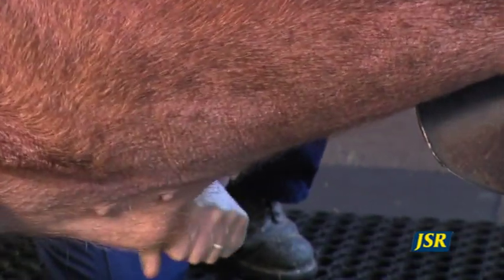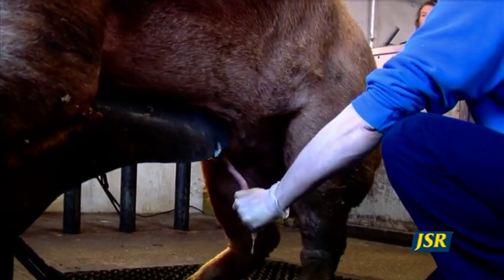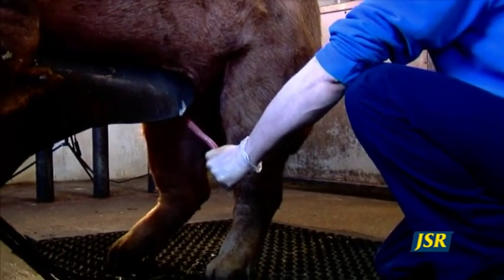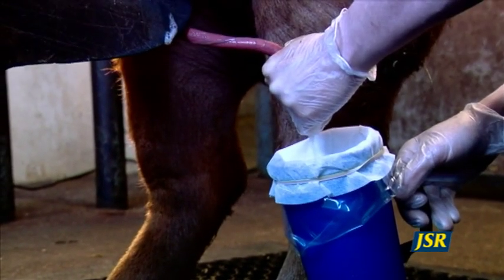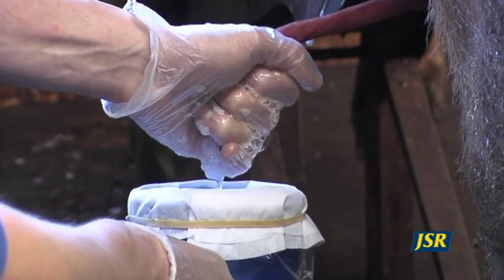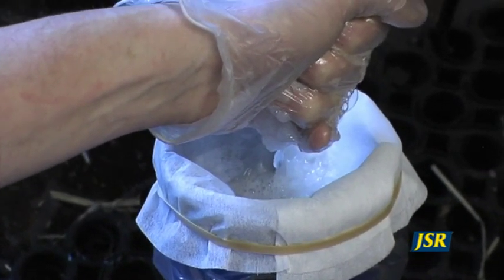Again, grip the penis firmly as it is extended and firmly pull it out, which encourages the boar to fully erect. Do not collect any material produced at this time; instead, wait for the characteristic pulsing of the penis and the thick white sperm-rich fraction to appear before collection. Some boars may produce two to four hundred millilitres over a period of three or four minutes. Wait until the boar is fully satisfied and finished before releasing the penis.